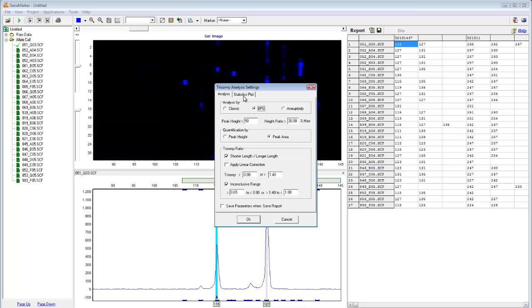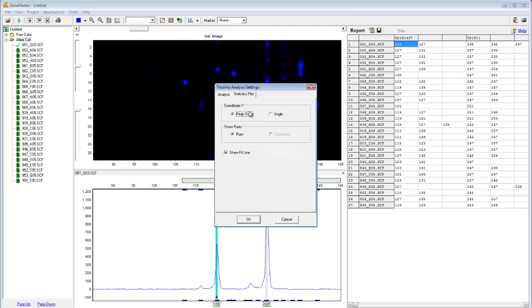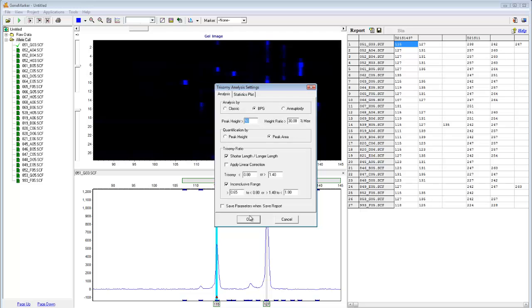The Statistics Plot tab gives you the option to modify the components of the ratio plot, which is included in the report. When you have made your selections, just click OK.